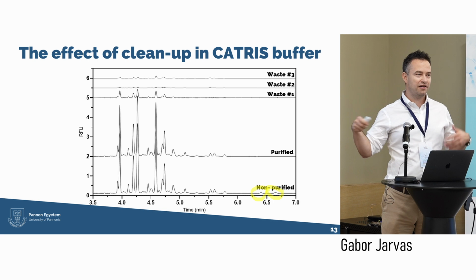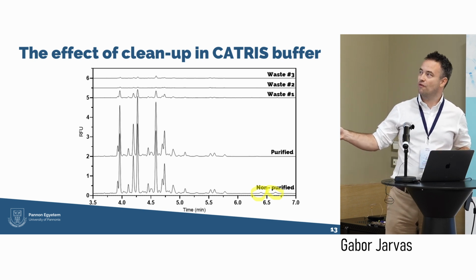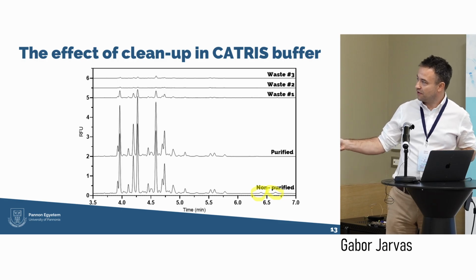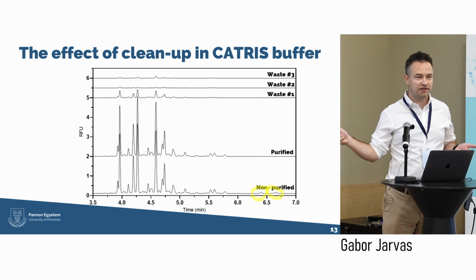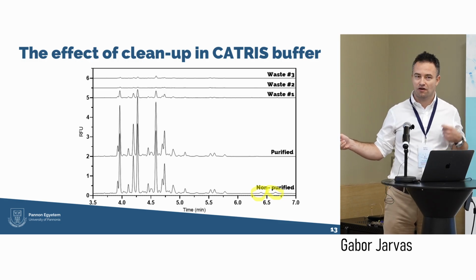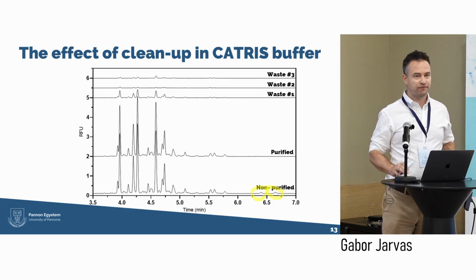That is why I call it a revolutionary step, because in this new approach, there is no way to lose those glycans. For example, it's also obvious. In the non-purified trace, you have these two small peaks, but in the purified, they have completely disappeared. And I do believe those glycans can hold very important clinical and biological information.